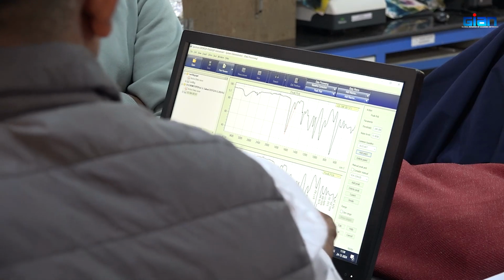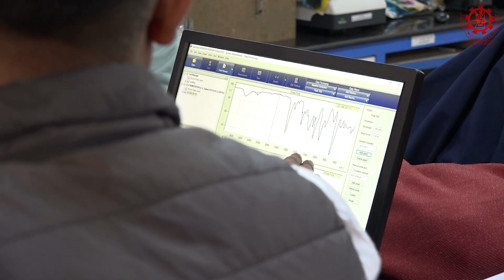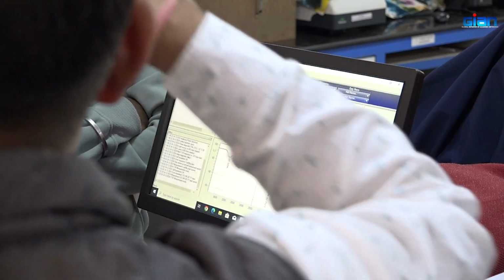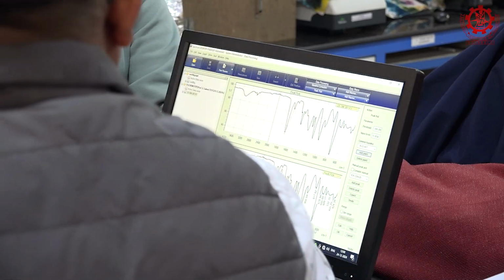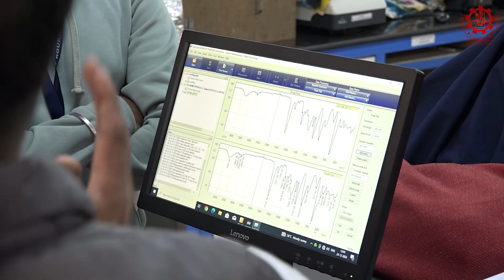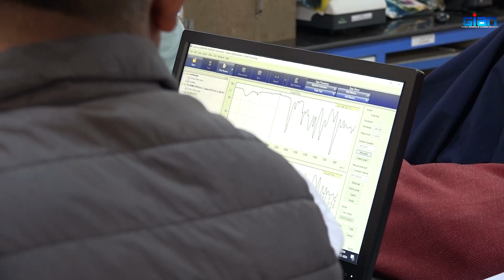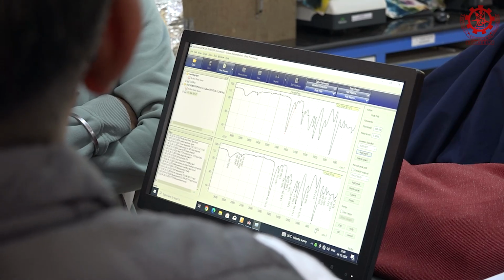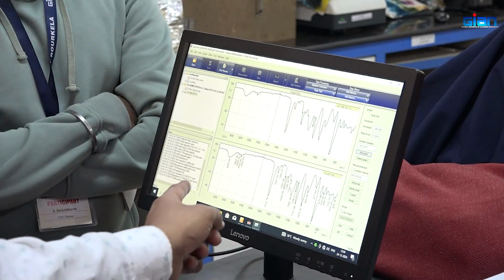Yes. So now you see what we did automatically. These are all advancements in spectrometers. So now it gave the peaks. Wherever there is a dip, it gives you the lowest point, what centimeter inverse that is. So at that centimeter inverse, your molecule has an absorption. Okay. For example, I discussed that 1712 is known for carbonyl absorption.